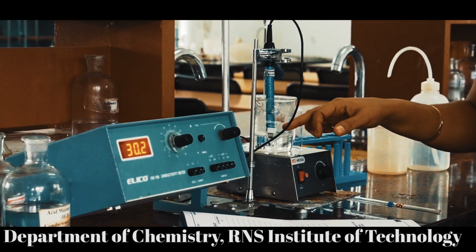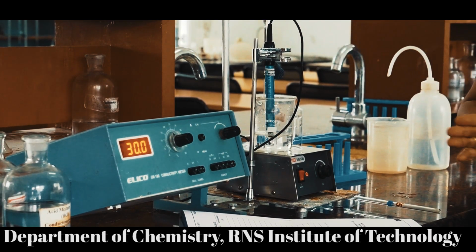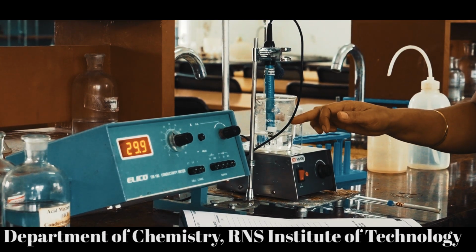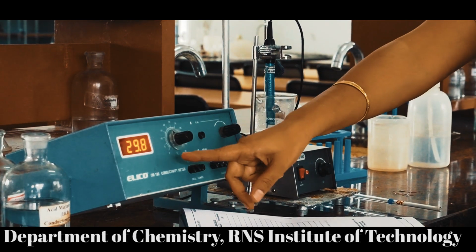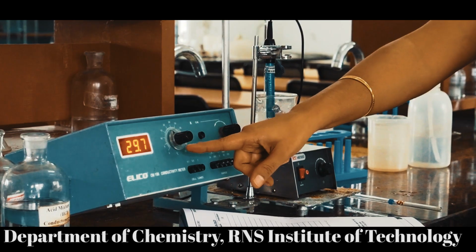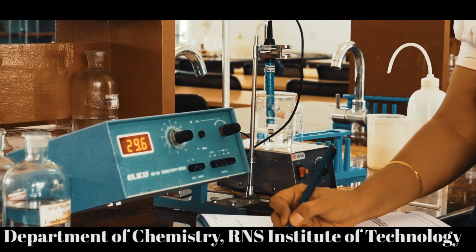During the neutralization of HCl, H+ ions will be replaced by less mobile Na+ ions, so there will be formation of sodium chloride. Because of the decrease in H+ ions, there will be a decrease in the conductance values also. Initially it was around 31.3. Now check it out, it is 29.6.